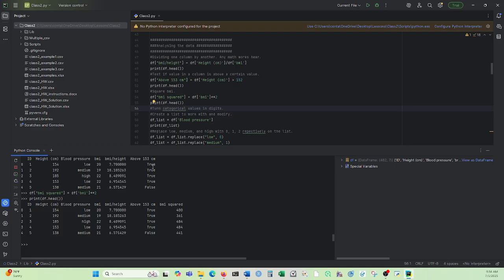So you can do a lot of stuff with this by making columns, by either data manipulations, or you can even assign a new column just values that you know of to it.